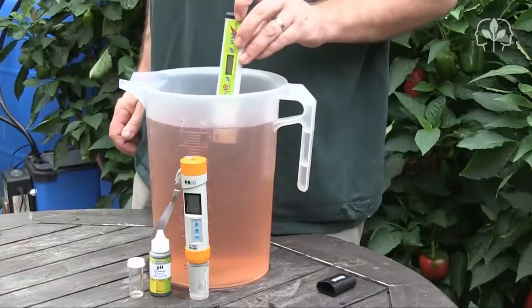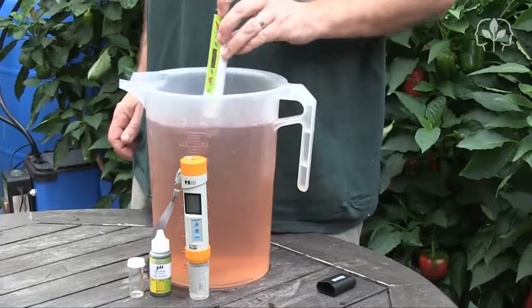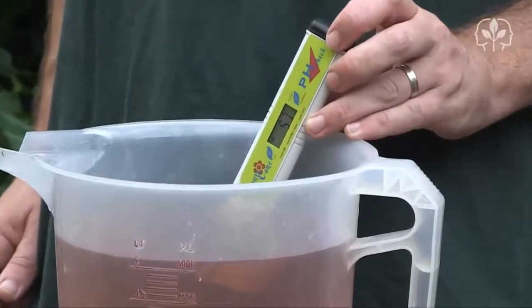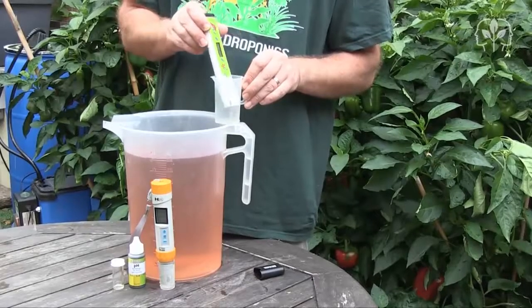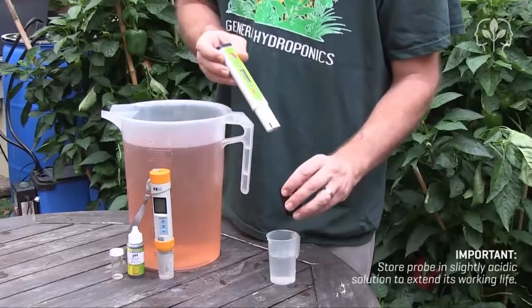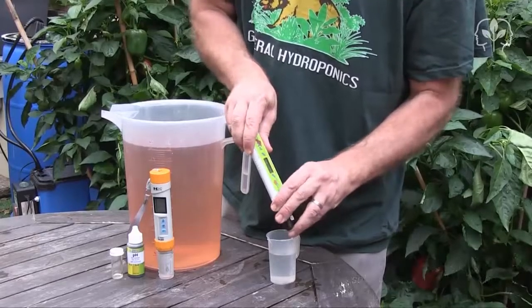If we want more accuracy we need to use a digital pH meter. Let's give this HordiCare meter a go. I keep stirring until the meter beeps and the reading stops flashing, and as you can see it's reading 5.7. Don't forget to give the probe a little wash in distilled water, and then keep the probe wet by pouring some solution into the cap. You can buy storage solution at your local hydro store, or just mix up some water to pH 3.5.